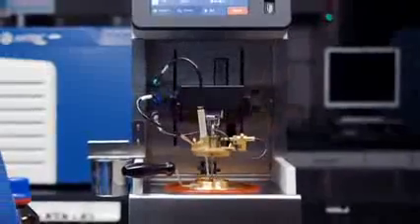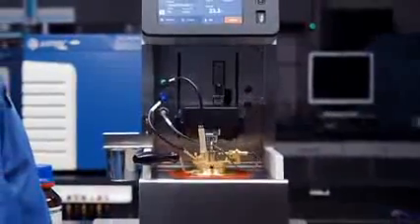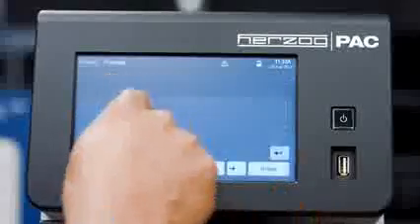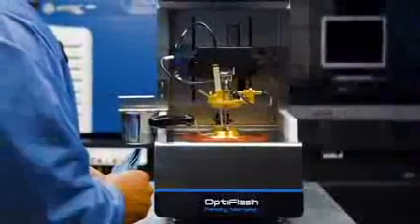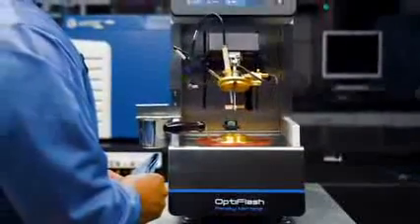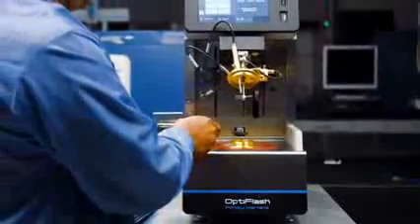PAC developed OptiFlash with our customers' challenges in mind. That's why it's easy to use, simple to clean, safer to operate and provides excellent quality control functionality. This leads to improved reliability of results, less time needed for operator training and a better performing instrument.